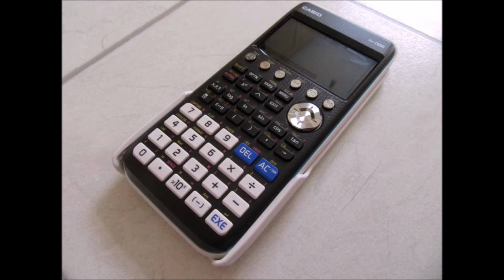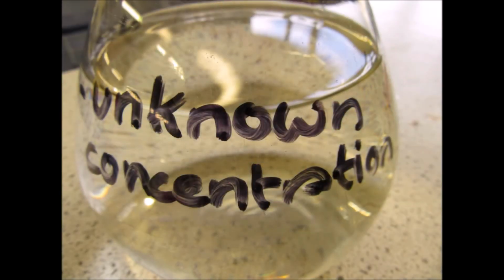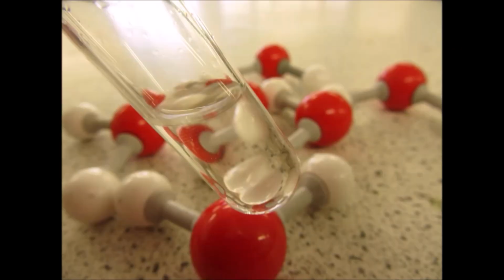Now perform your calculations, asking your teacher if you are unsure of proper calculation methods. You should now have determined the unknown concentration. If, however, no acid was required for neutralization, your solution must have been water in its purest form. Pure water.